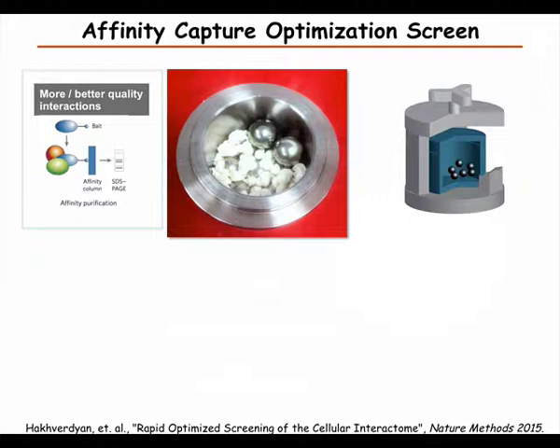But that's very difficult, and usually they are still quite a lot bigger. The way this works is that you have these metal balls, and you cool this in liquid nitrogen, and move this whole jar so that the balls crush the cells.